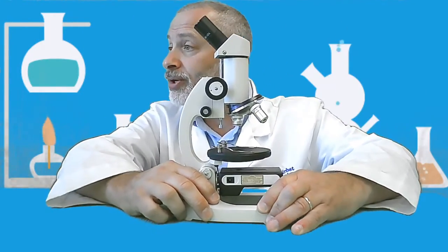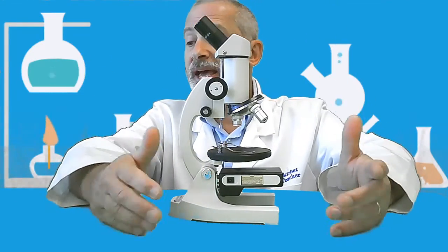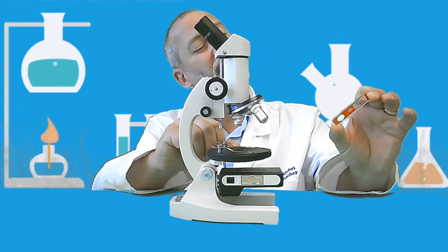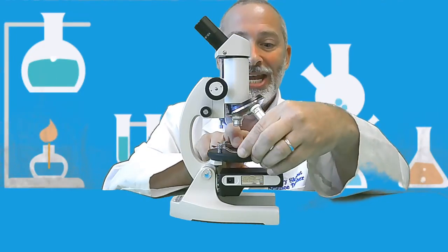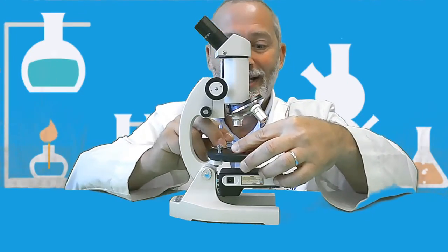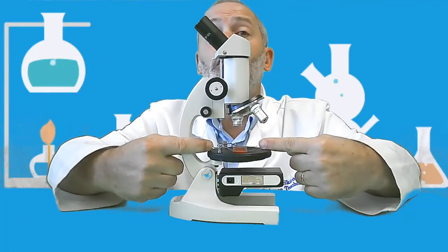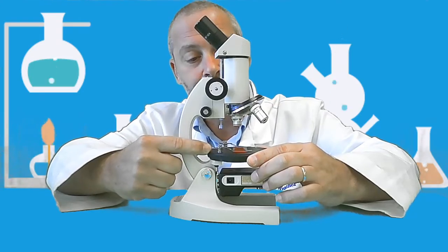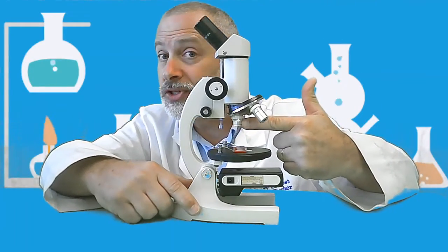I mentioned to you before that when we begin looking at a specimen, let's say we are putting our slide of human blood. I want to look at the blood. Okay, so let's say we have a slide of some specimen on the stage, and we want to start looking at it. Remember what this is called?